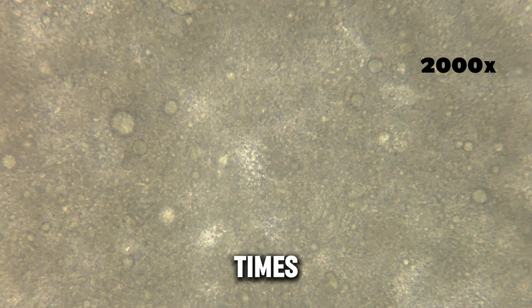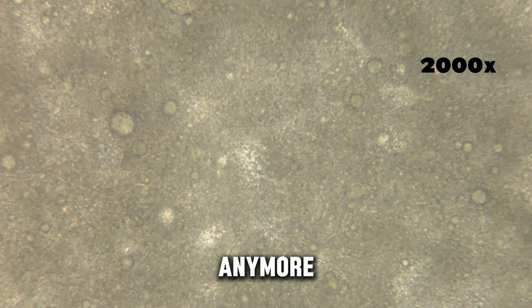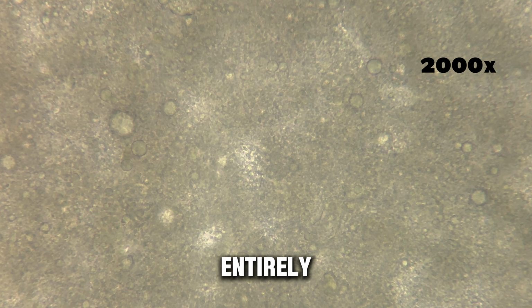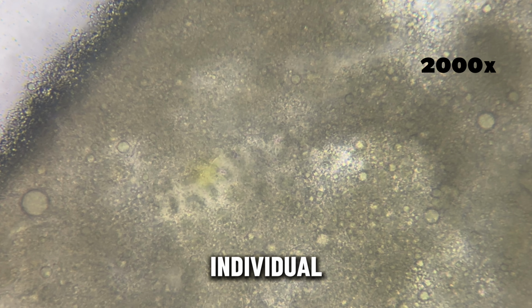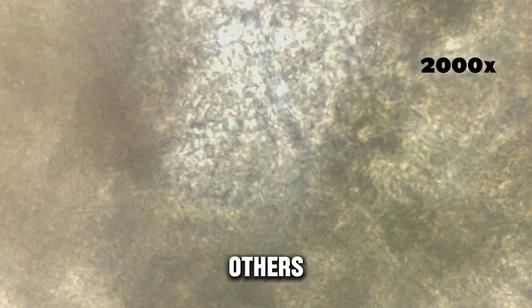At 2,000 times magnification, mustard becomes almost completely abstract. Nothing in the image resembles a sauce anymore. The familiar idea of mustard disappears entirely. Individual structures are now sharply defined. Thin walls, irregular fragments, and tiny particles fill the frame. Some areas appear tightly organized and compact. Others look chaotic and broken apart.